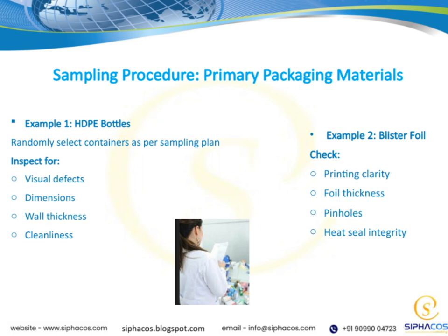Pinholes are another critical point. Any pinholes can compromise the integrity of the packaging. Lastly, we must confirm the heat seal integrity, making sure the seal is strong and secure to protect the product.